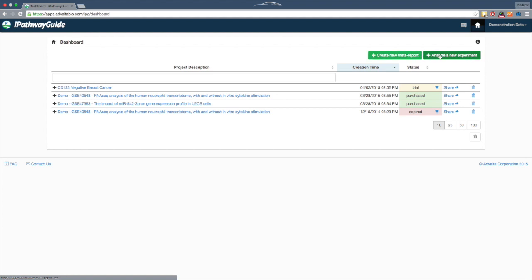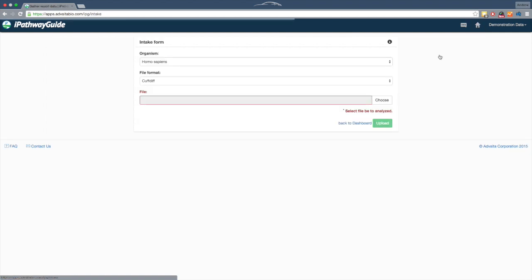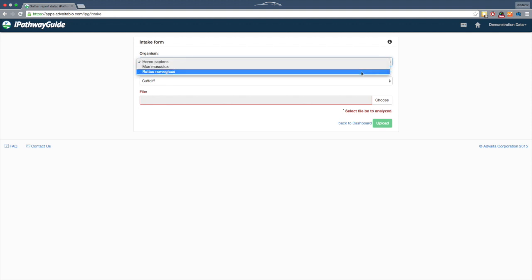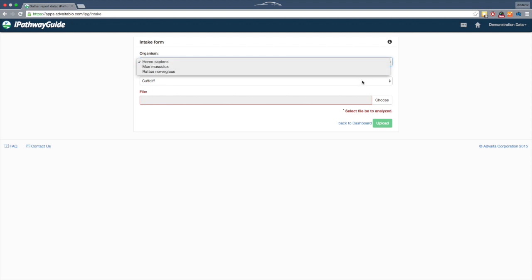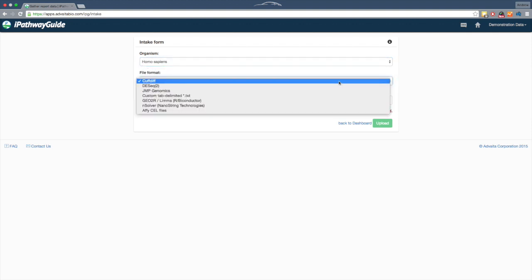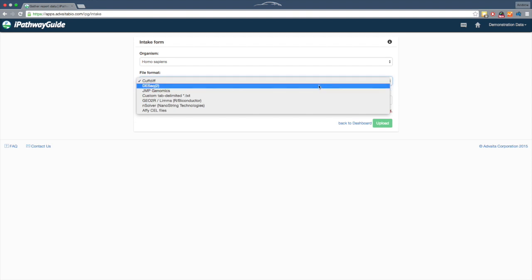Starting a new analysis is easy with iPathway Guide. Start by selecting which organism corresponds to your data. Next, select the source of your data. iPathway Guide can use any gene expression data from the following sources.